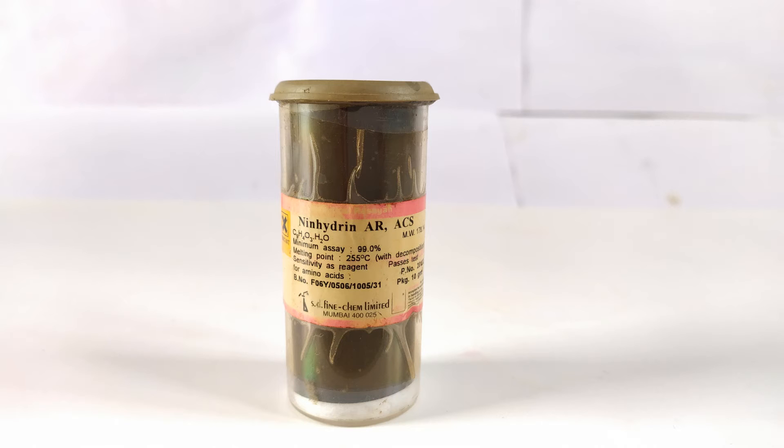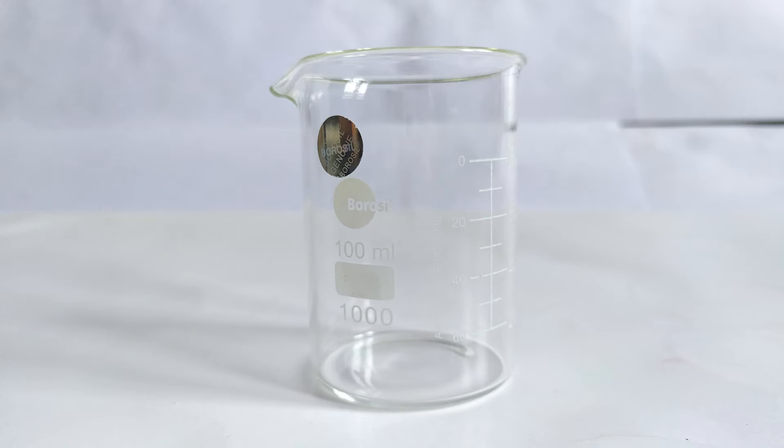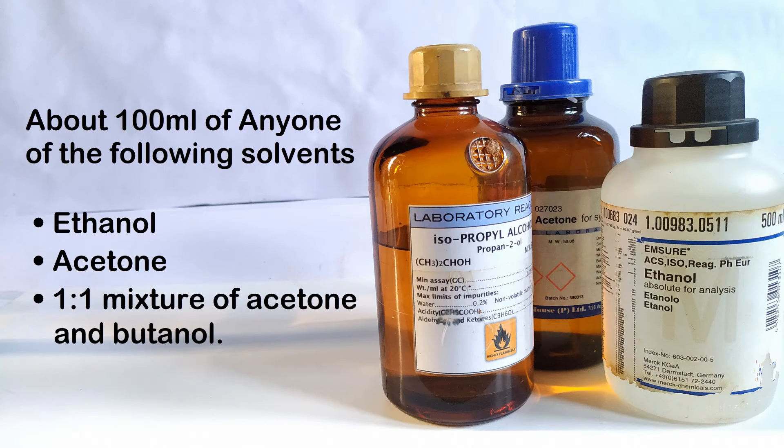The following materials will be required: ninhydrin powder, a 100 ml volumetric flask or graduated cylinder, a 100 ml beaker, stirring rod, funnel, a suitable air-tight and labeled container for storing the prepared reagent, and about 100 ml of any one of the following solvents — ethanol, acetone, or a 1:1 mixture of acetone and butanol.